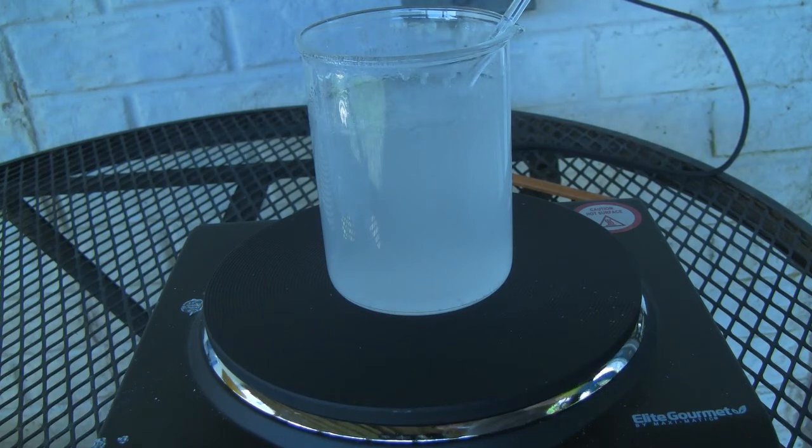The crude ASA is then recrystallized using about 200 milliliters of distilled water to further purify it. Seen here, the solution is a little cloudy, but it can be fixed by adding a little more water until the solution clears up. I chose not to add more water here because the beaker is already uncomfortably full.